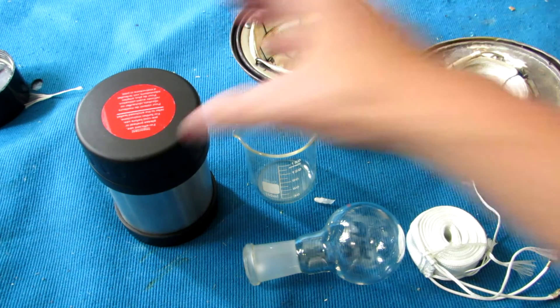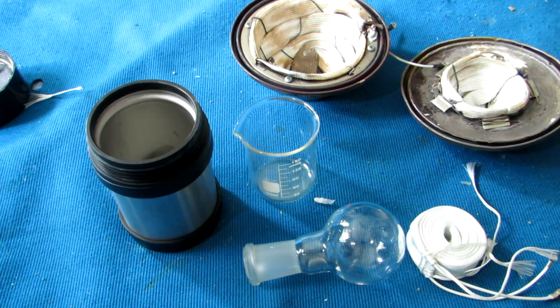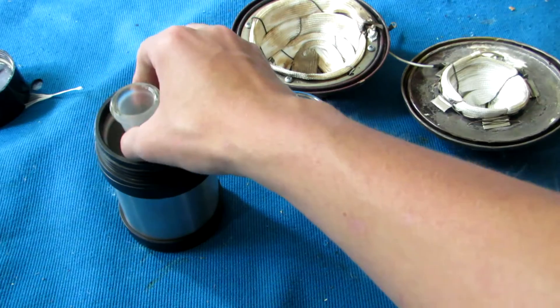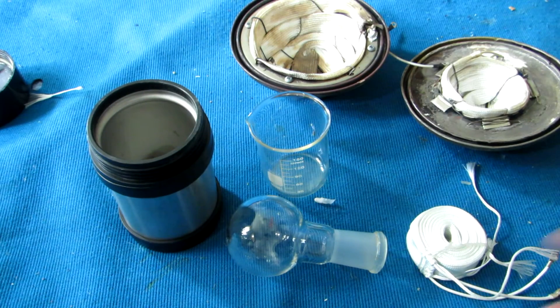To better insulate the heating tapes, I picked up a few old metal thermoses from the second hand store. This size of thermos seems to fit a 100ml beaker or 100ml round bottom flask very well, but if you're wanting a different sized heating mantle, just look for a different thermos size.